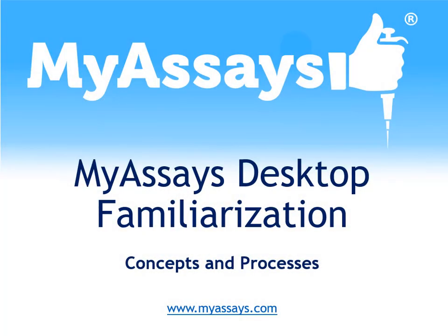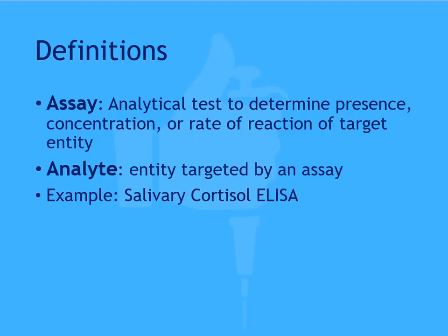In this video, I'll go over some of the fundamental concepts and processes integral to using MyAssays. An assay is an analytical test used to determine the presence, concentration, or enzymatic rate of targeted entities. These targeted entities are called analytes. An example of an assay is a salivary cortisol ELISA. This assay is for the quantification of the analyte cortisol in salivary samples.